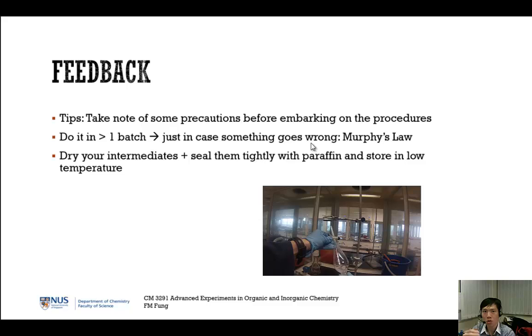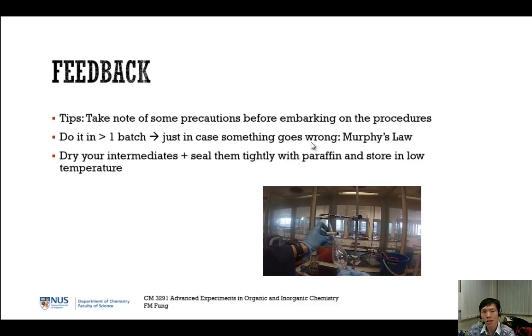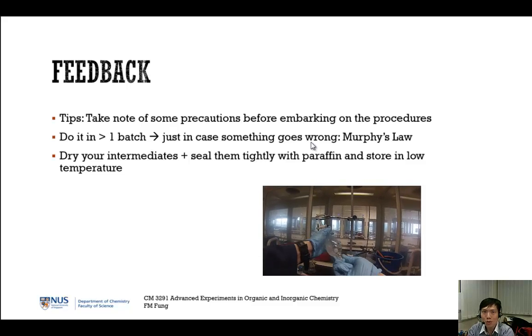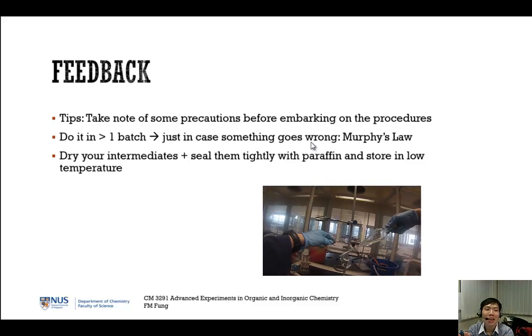Okay, maybe the first time is a trial, just like in titration in some experiment. The first time you just do it in a more carefree manner, maybe just to test the environment, to see how familiar you are with the kind of setup and reactions. Of course I don't have to impose on you. You can do it in one batch. It's perfectly fine, but you should listen up.